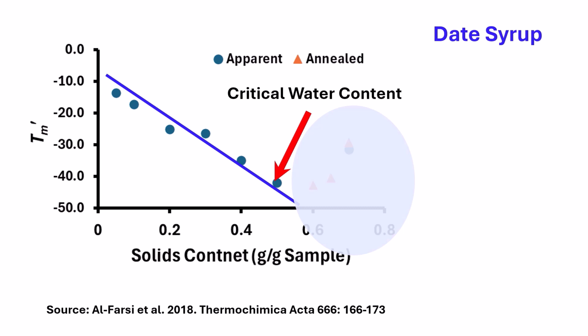However, in most cases, solids content of 0.4 gram per gram sample would be a reasonably good option to be considered. It is not yet the ultimate maximal freeze concentration condition, since further time could be required to achieve equilibrium.